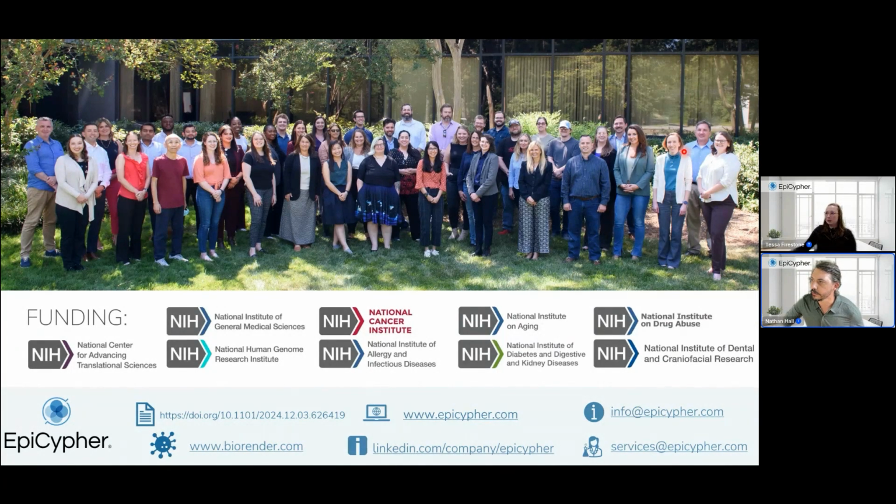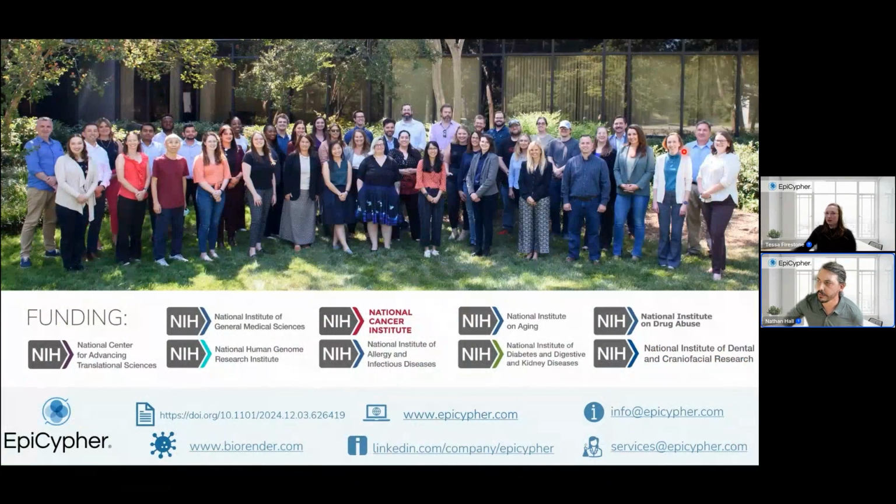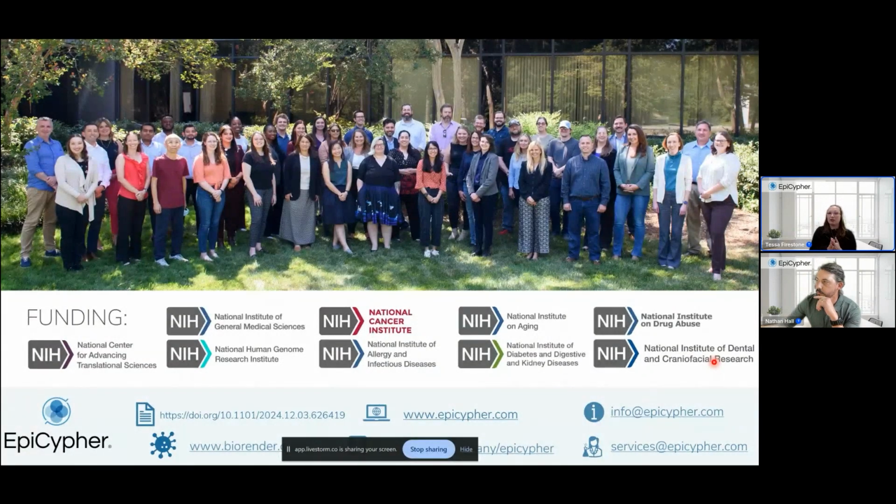So the first question: 3 to 5 distinct antibodies to test for cut&run. Could you reiterate our antibody testing regime that we usually employ? Yeah, we usually recommend 3 to 5 different antibodies that are picked from different immunogen regions, like amino acids 1 through 30 versus 103 to 400, depending how big your protein is. Or if they're from the same immunogen region, try looking at different species, like a rabbit versus a mouse antibody.